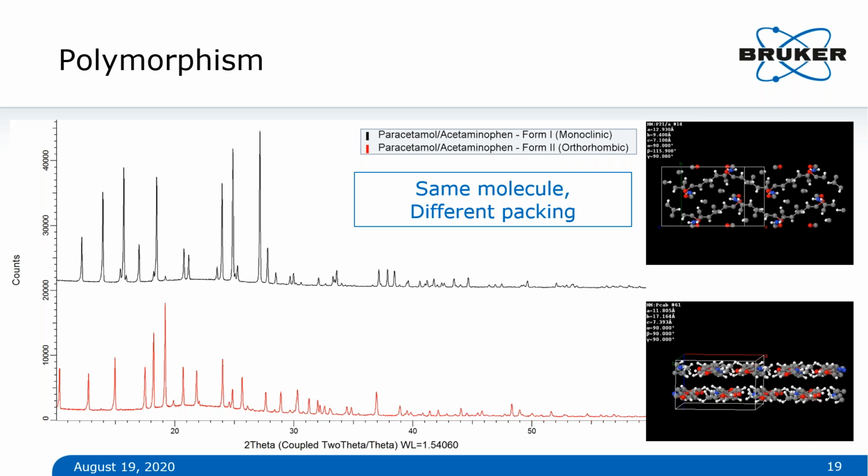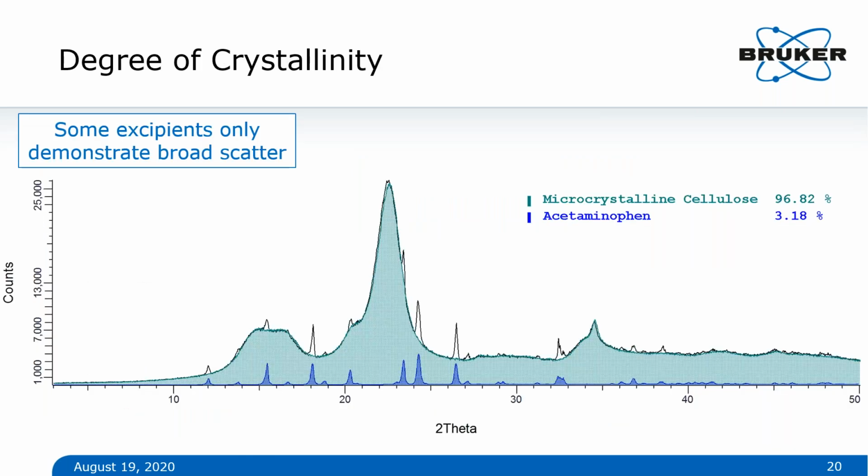Right? That is a material that has long-range order that gives rise to that diffraction phenomenon. So here we would see that the acetaminophen does have those sharp peaks, but for the microcrystalline cellulose, you just end up with this characteristic broad, blobby, non-flat background. So that part of the sample would be referred to as an amorphous or a poorly crystalline material.